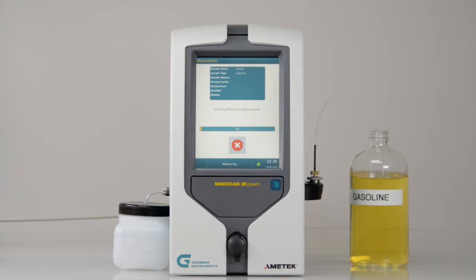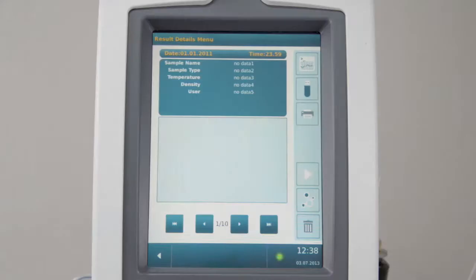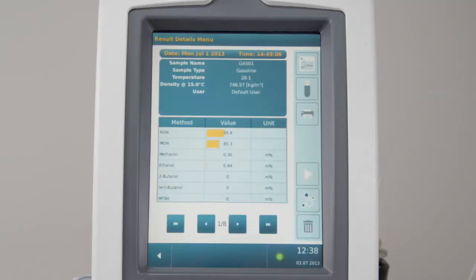The instrument regulates the temperature of the filler, the cells, and the density meter, starts rinsing and reference measurements, and scans the sample. After a short time, the result is presented.